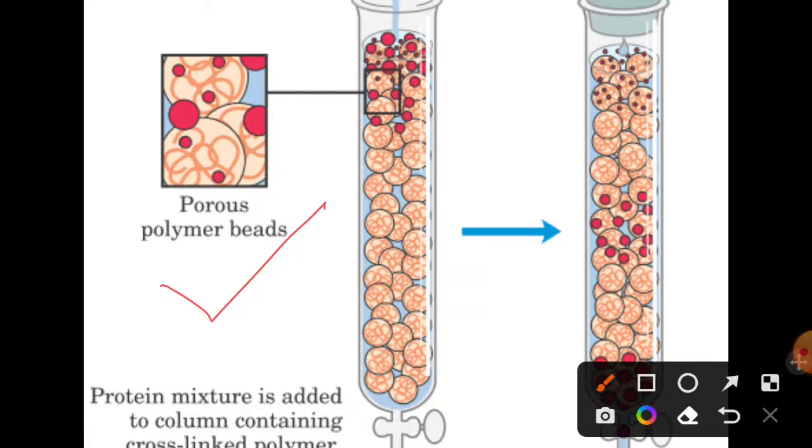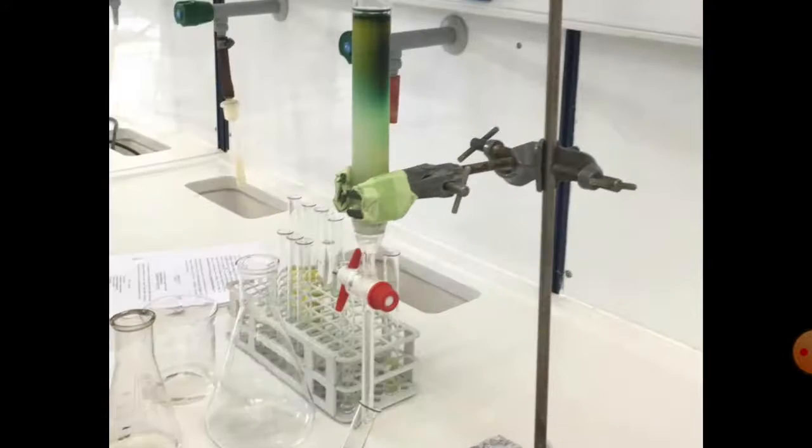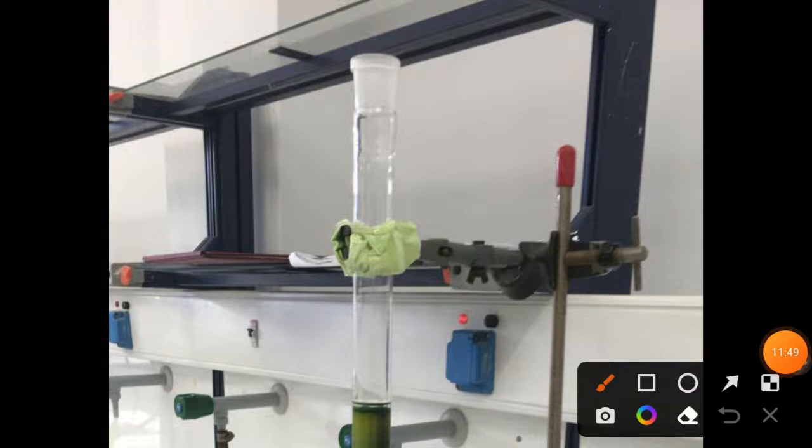So what will be your preferable choice? For me, the preferable choice will be column chromatography. Why? Because in column chromatography the larger molecule will separate last, right. So all the debris will be removed faster, then we will add an elute buffer, or elution buffer as it is commonly known, to obtain our sample, so that we can purify them, right.